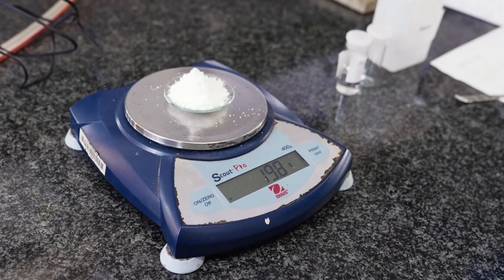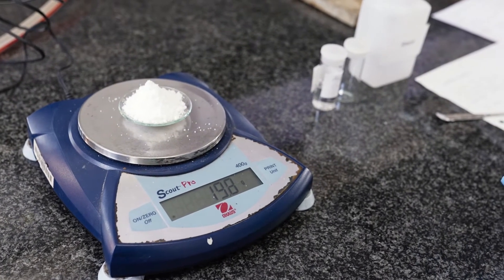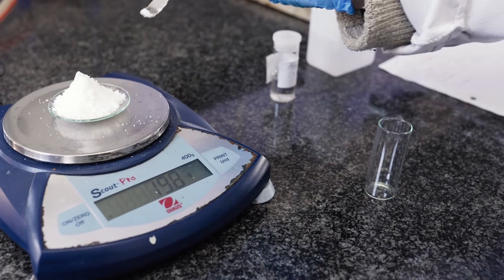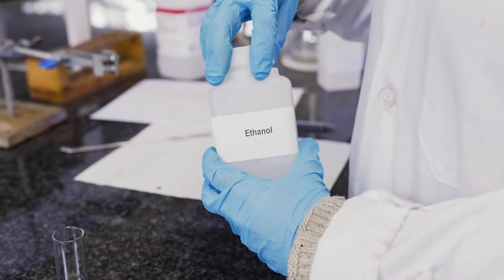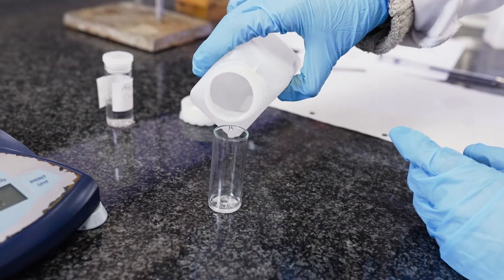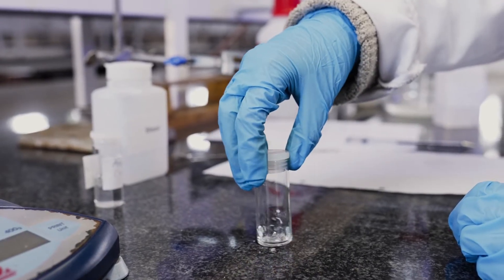We now have our aspirin synthesized, or at least what we hope is aspirin. So now we need to do our TLC plate. We're going to dissolve some of our aspirin in ethanol and then we're going to use a capillary tube to spot them on our TLC plate.